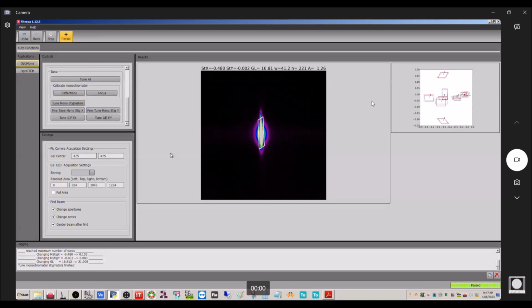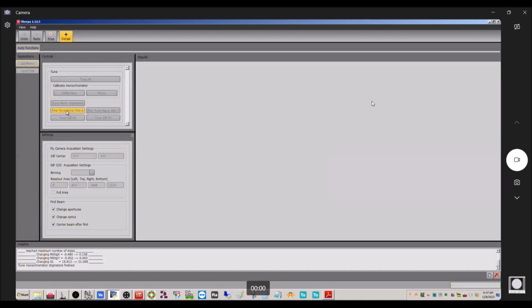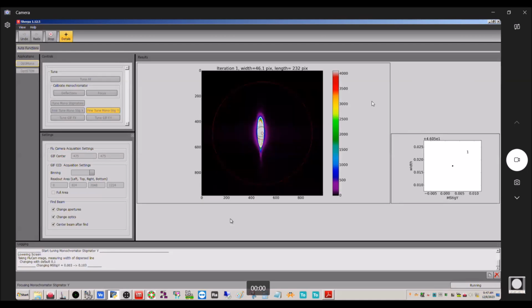Okay, so let's go ahead and see if this will work. Okay, yeah, so it wouldn't do this. No camera selected. Let's see. Will it let us do this? Probably not. Okay, so we're stuck with doing this. Again, it wouldn't let us do that because we'd stop talking to it.